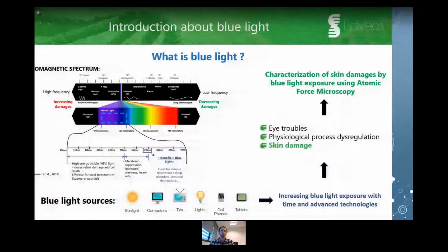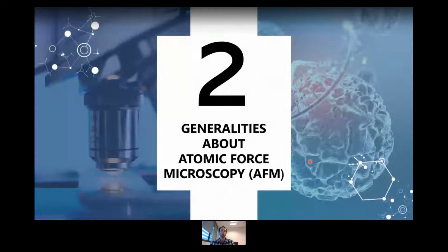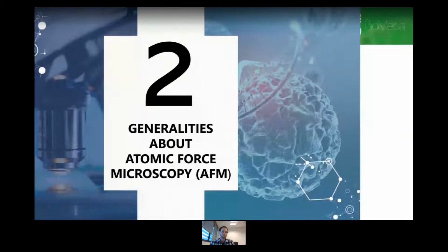So now let's move on to some generalities about the principle of atomic force microscopy and see what we can use from AFM to study blue light effects in skin. So the principle of the AFM is as follows.